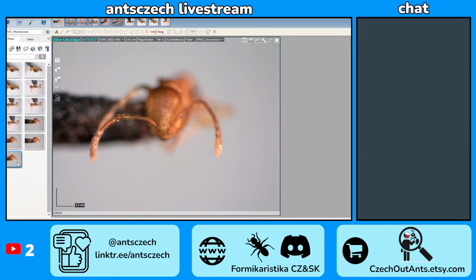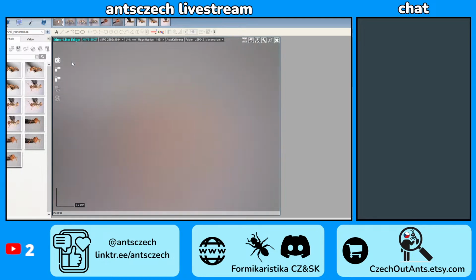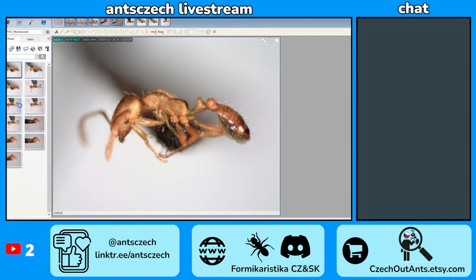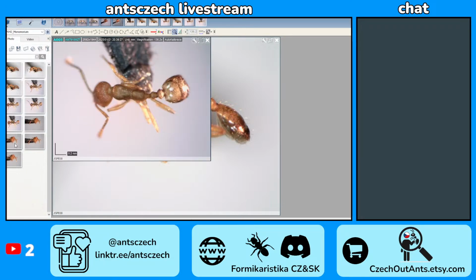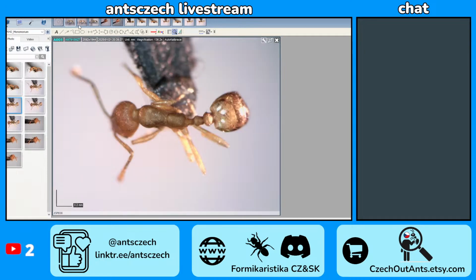Let's take one more picture of the head. I mean, it's Monomorium. I don't need some special stuff, but whoa. I didn't rename. Oh no. They put them in the wrong box. It looks like it. Man.